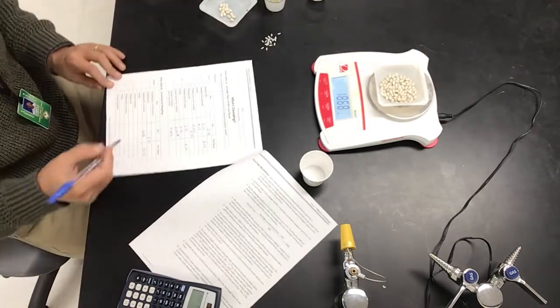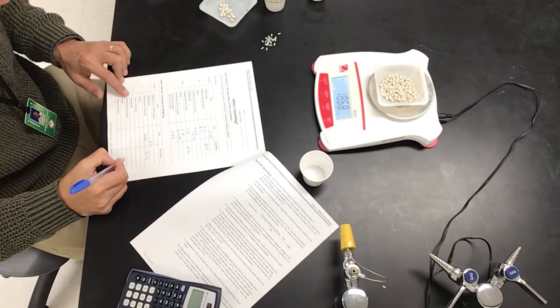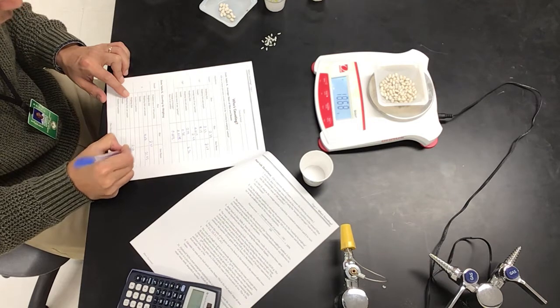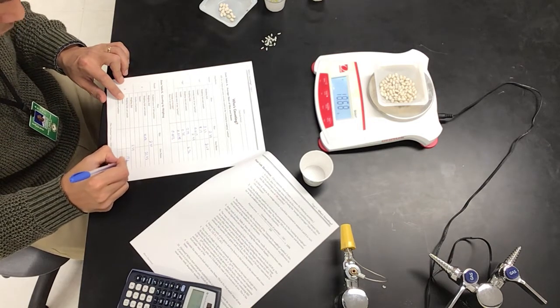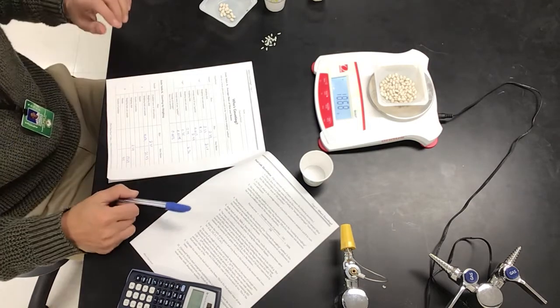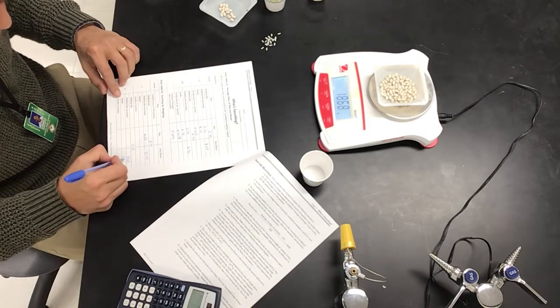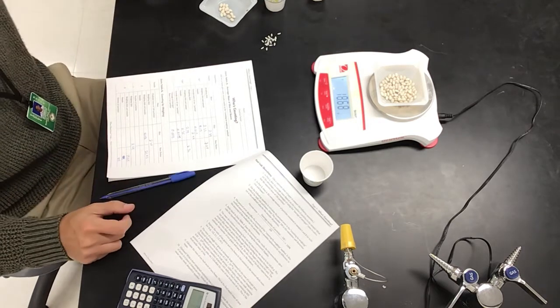Number of particles is 84. Weighing dish is still 2.39. Weighing dish and sample is 18.64. You can figure out the sample. Number of particles 84. Same thing with the rice.